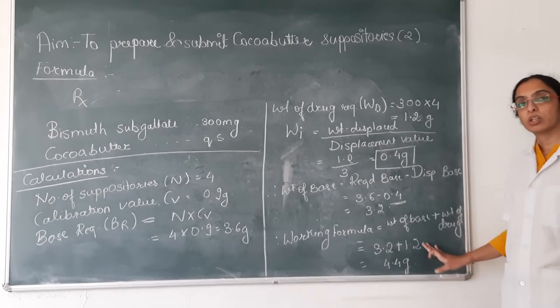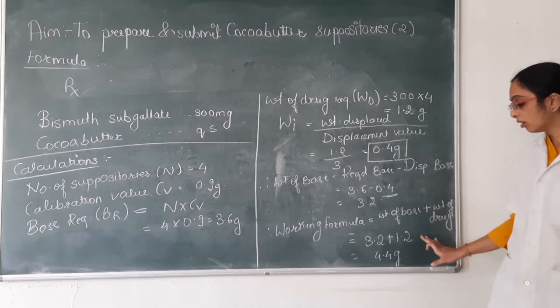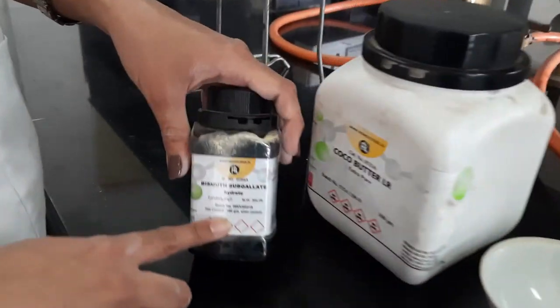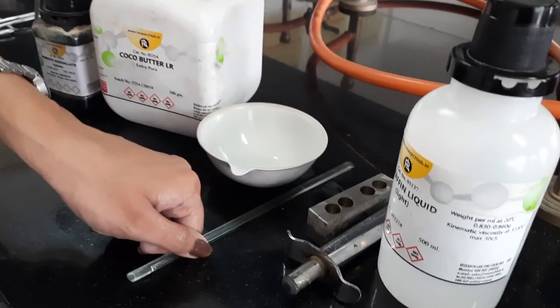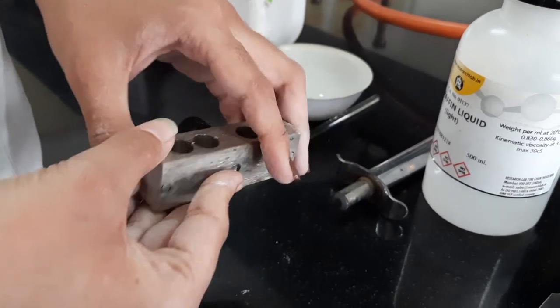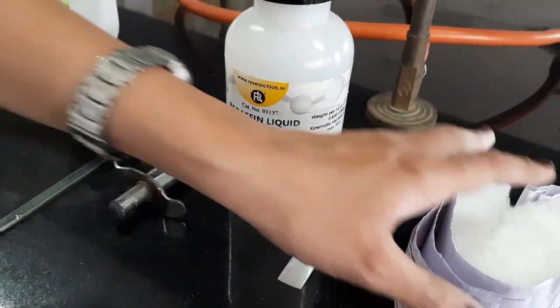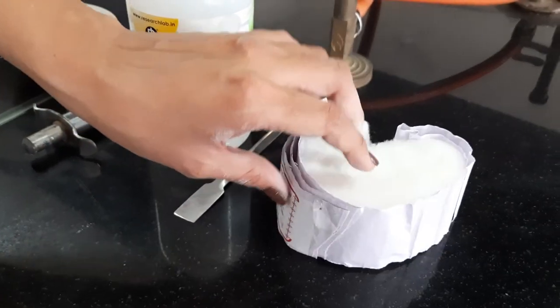Now we will see how to perform the procedure. The requirements are bismuth subgallate, coca butter as base, a petri dish, glass rod, suppository mold whose calibration has already been done at 0.9 gram for 1-gram capacity, a lighter, liquid paraffin for lubrication of the mold, a spatula, and cotton for lubrication.